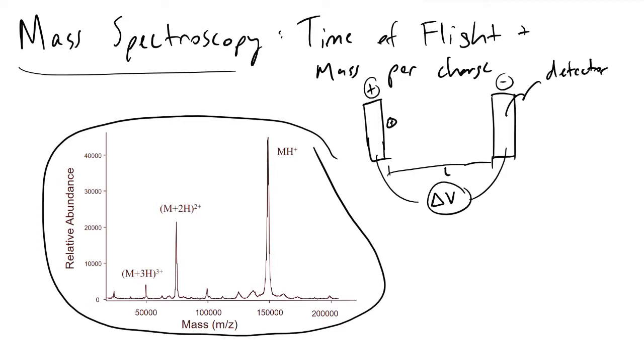The first thing we're going to do is go back to physics, E&M, and recall what the definition of voltage is. Voltage, V, or delta V, a potential difference, tells us the amount of energy per charge, joules per coulomb of charge. What we can rewrite that as is this: joules will have some units of potential energy, and coulombs I'll call Q for charge.